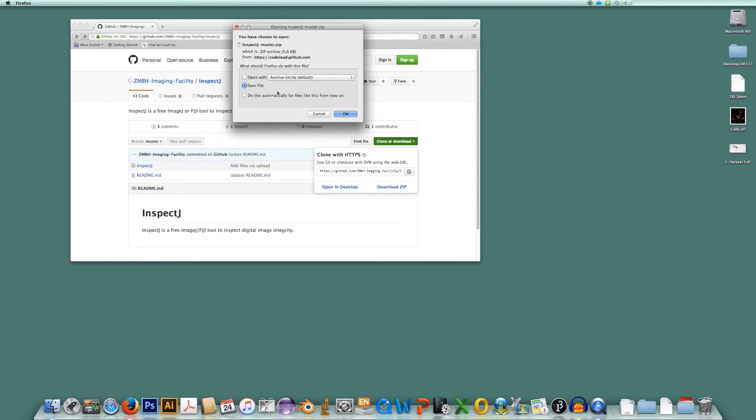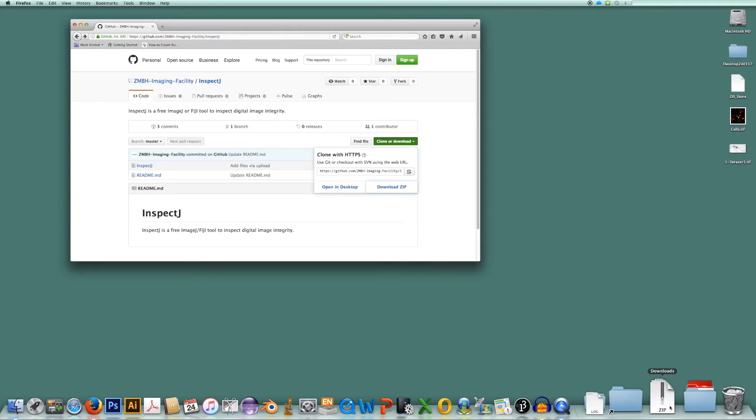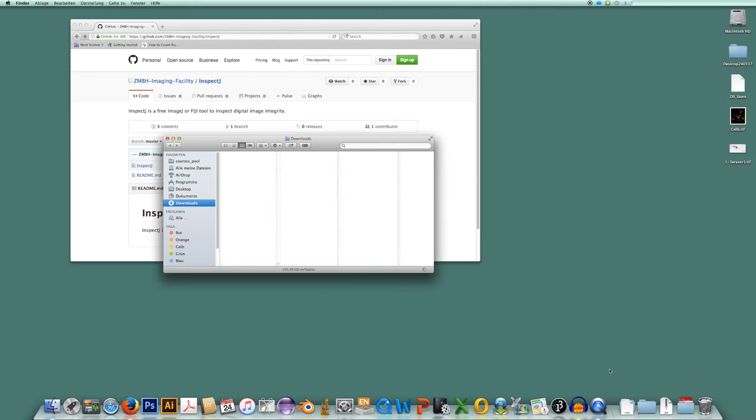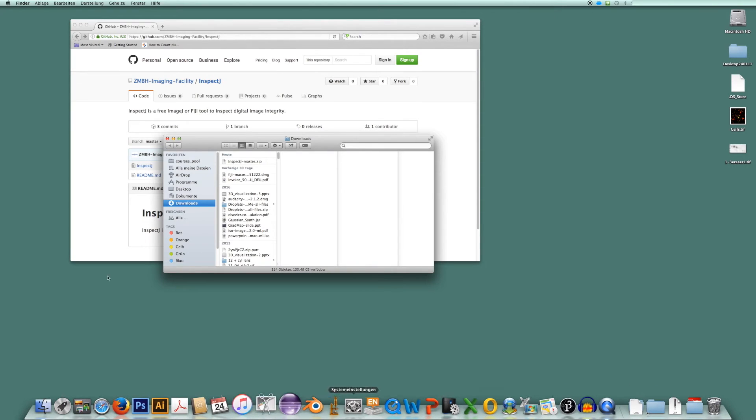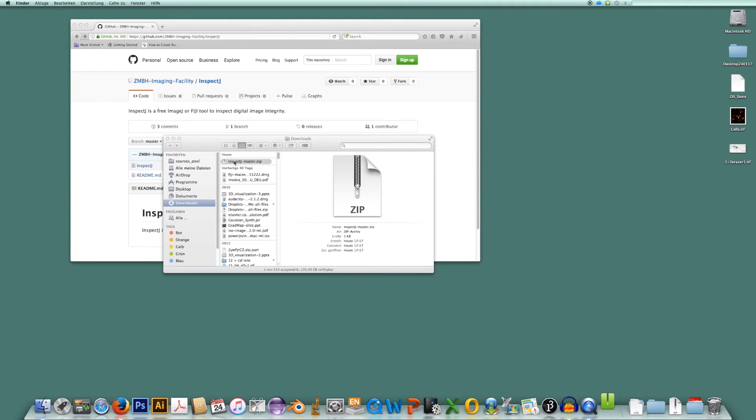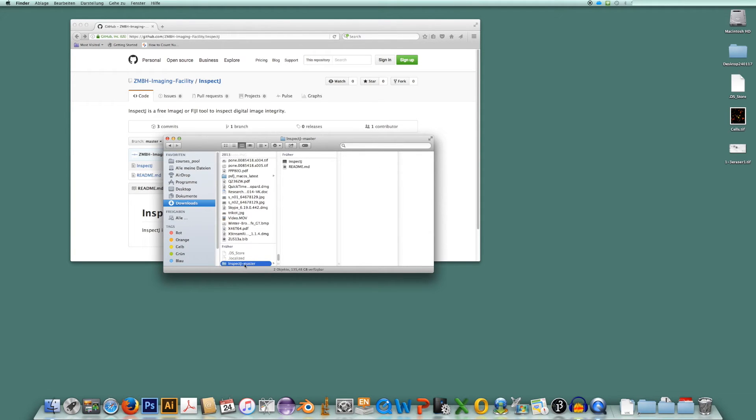And I will save the file. Okay, the file is now in my downloads. Let me open this. Here is my zipped folder. I unzip it. Here is my unzipped folder.